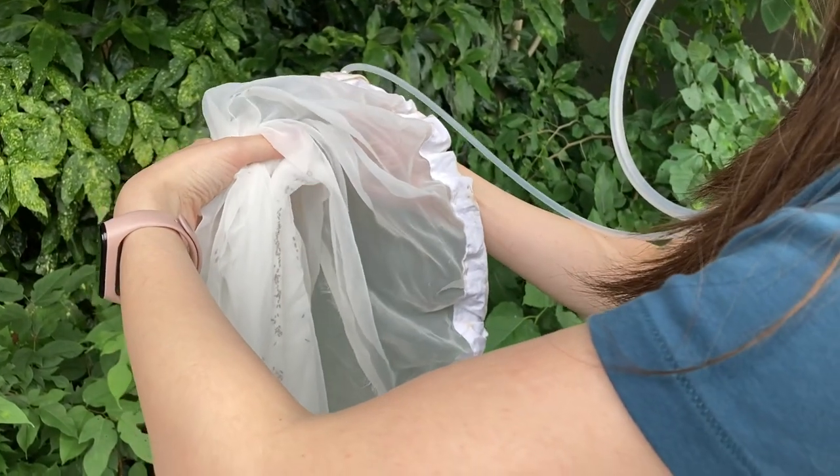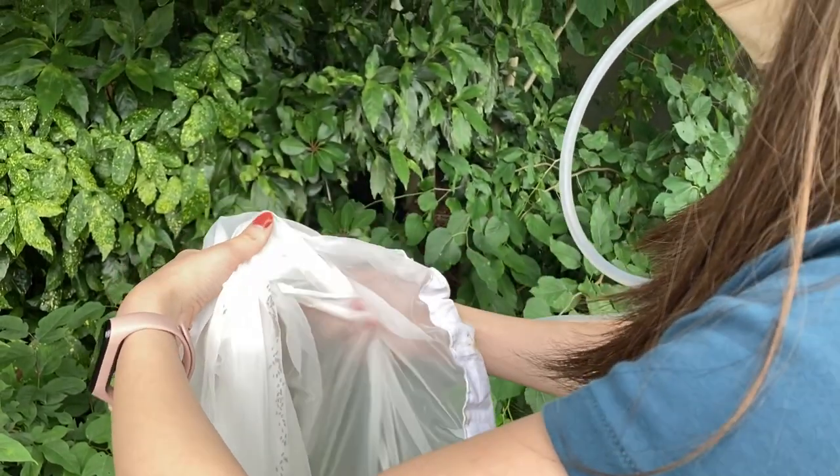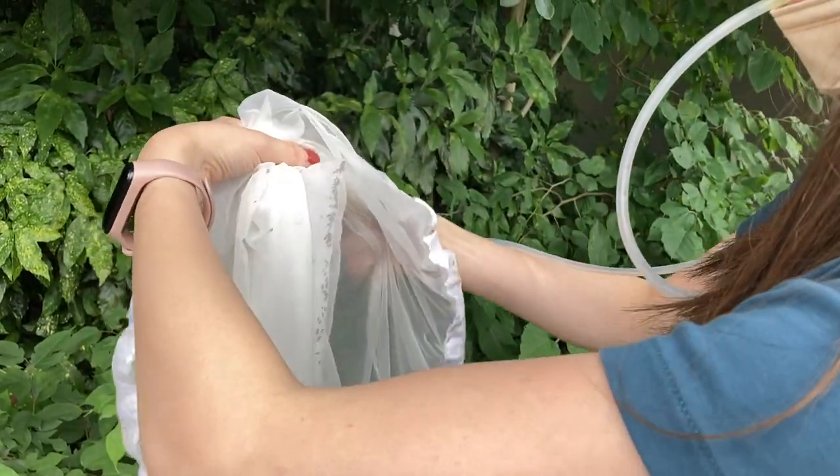Then, you can collect flies by using an aspirator with mesh to prevent them from being sucked, and collect them in a container.